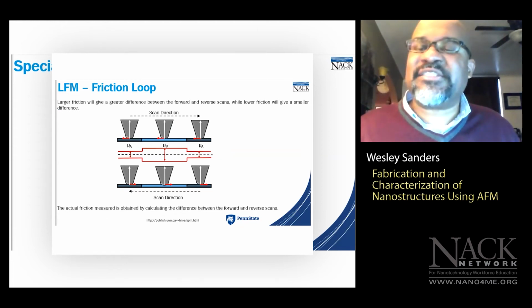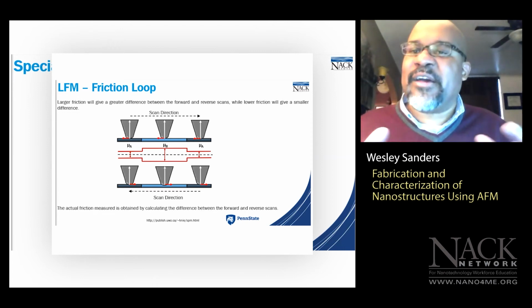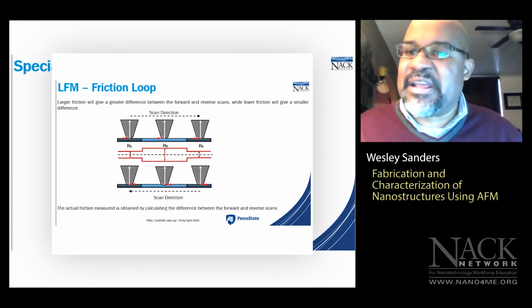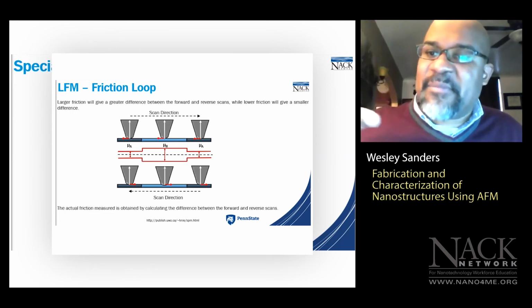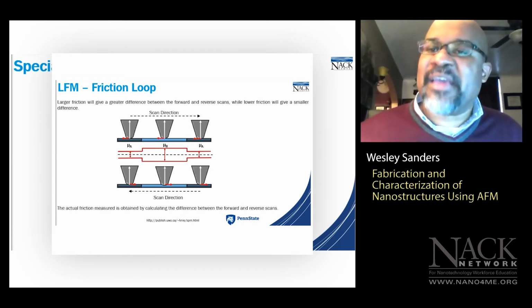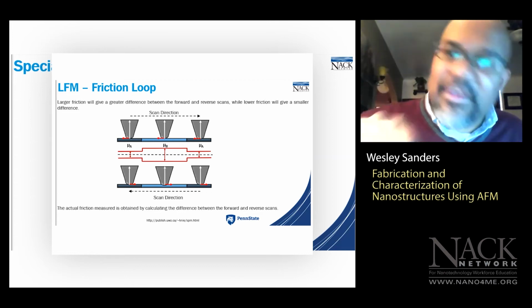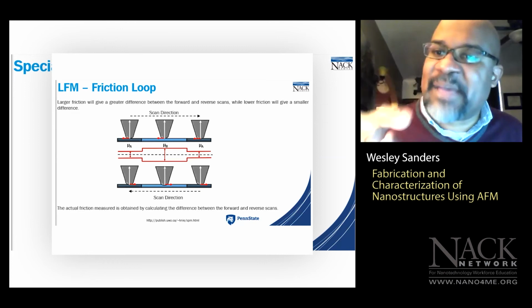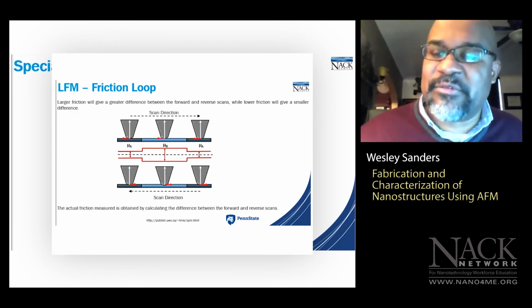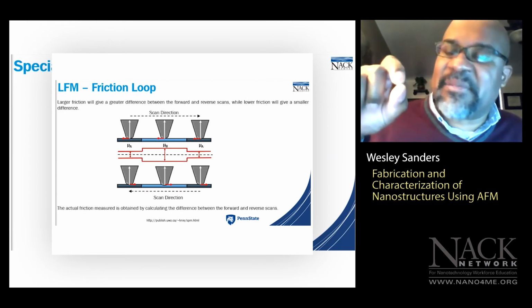So this is something I should have emphasized a few minutes ago. When you use lateral force microscopy, you're operating under normal contact mode conditions, which means you're using a really low set point. So as an AFM user, you would enter in a set point that allows a tip to make contact with the sample just enough to trace the surface topography. Right, so the tip sample interaction is on the order of nanonewtons. So it's an extremely gentle interaction between the tip and the sample.